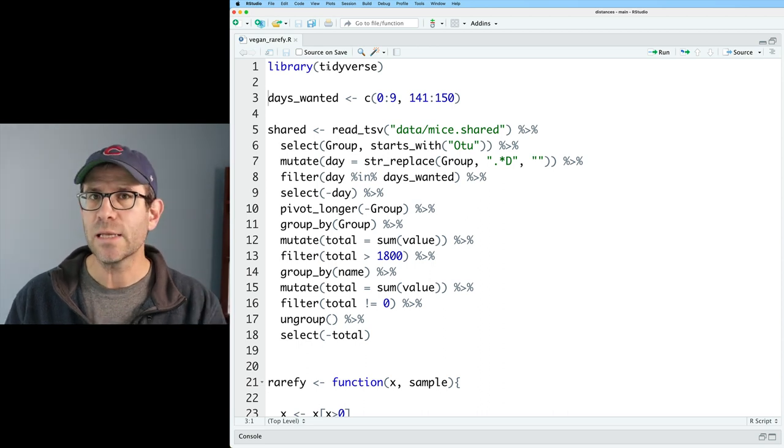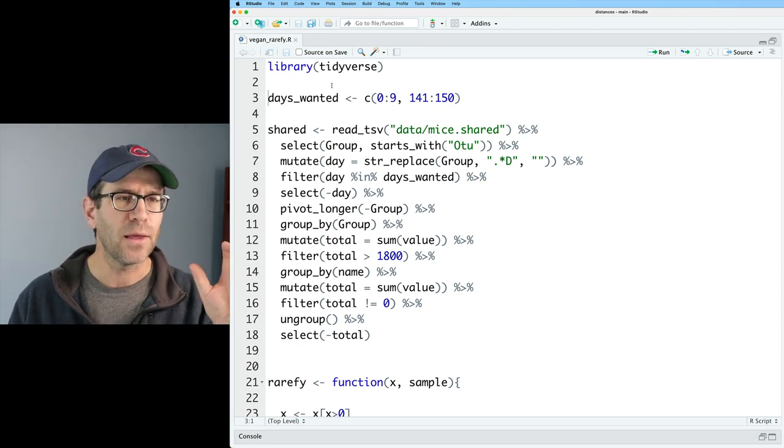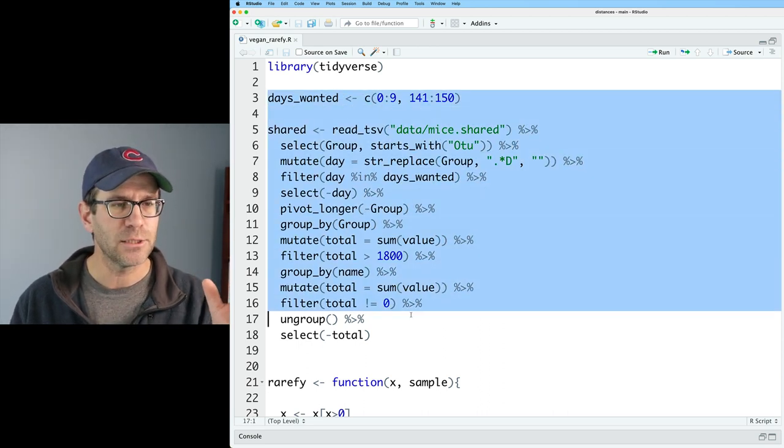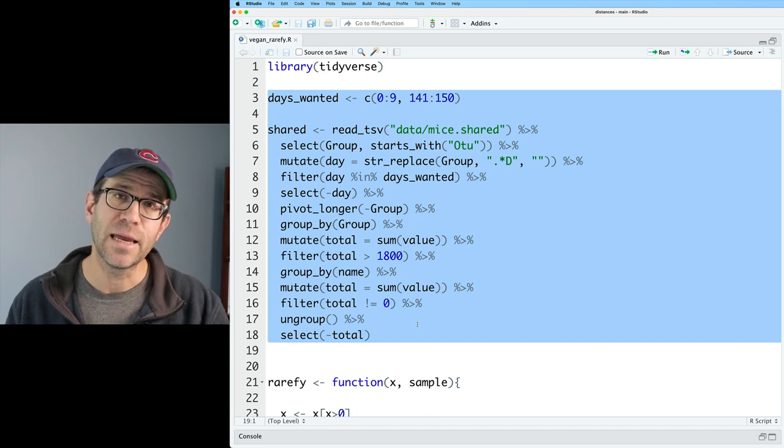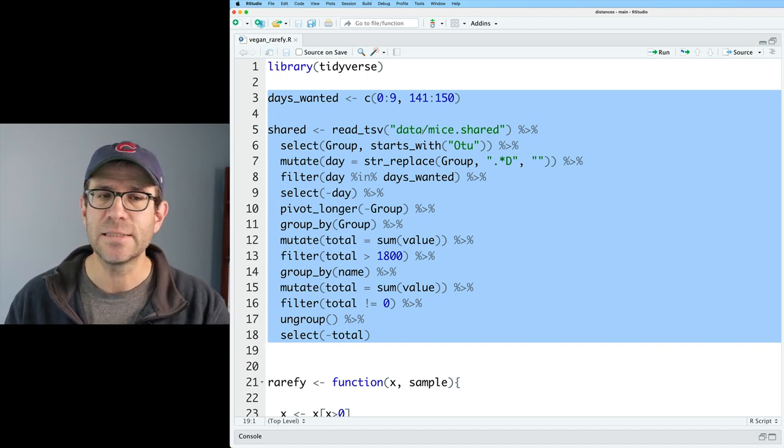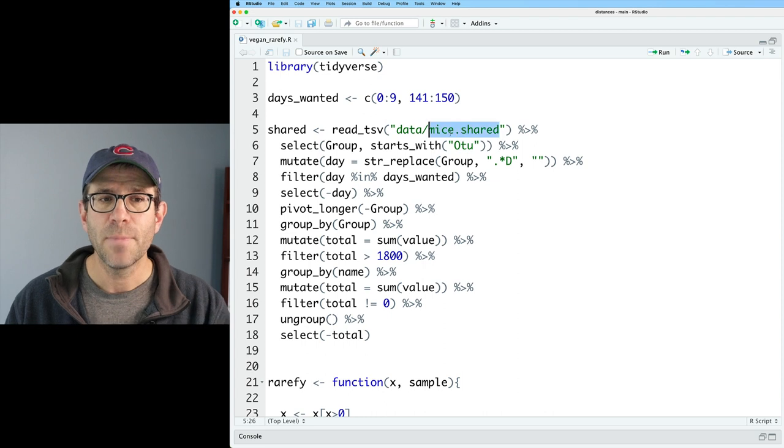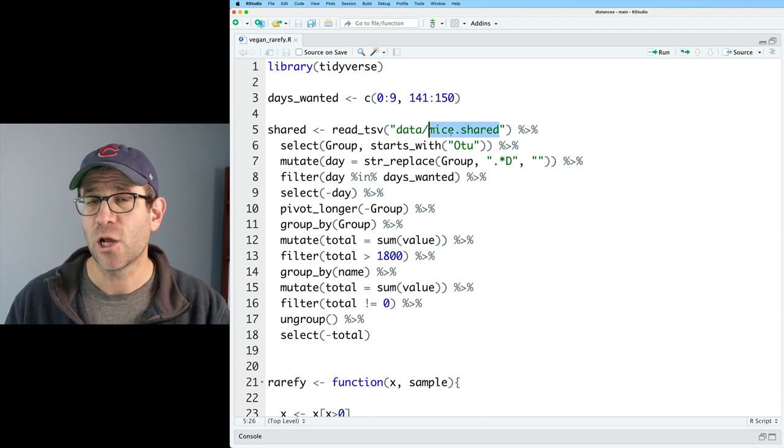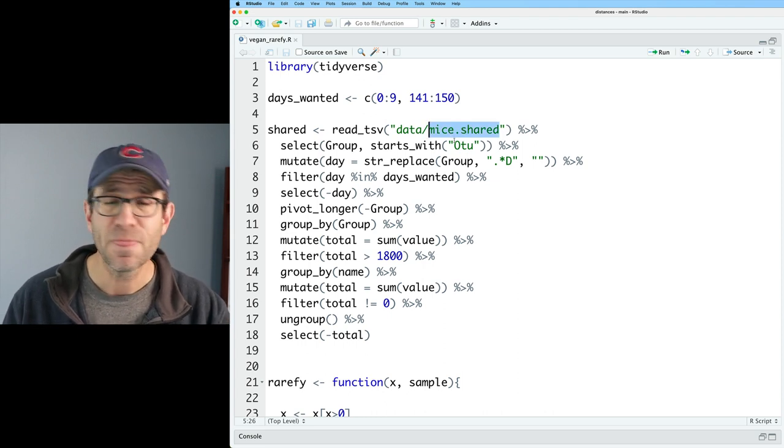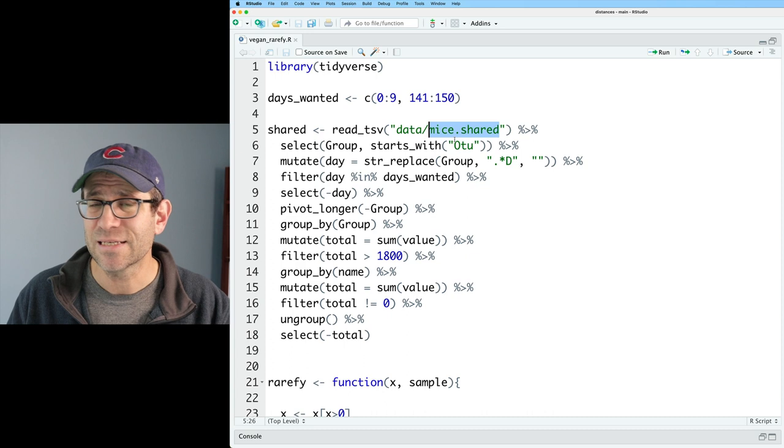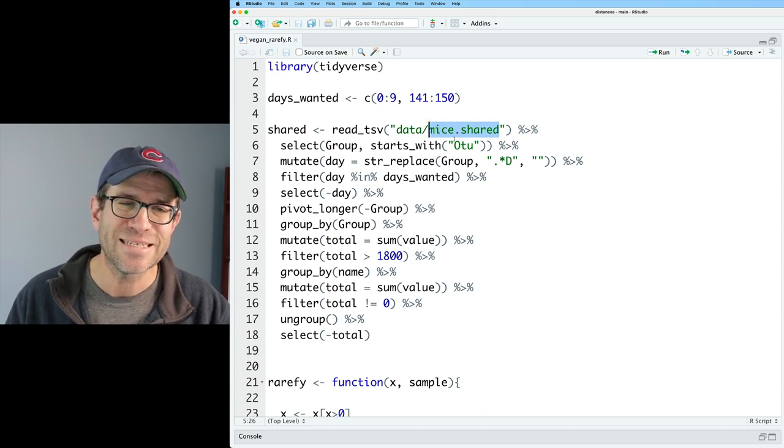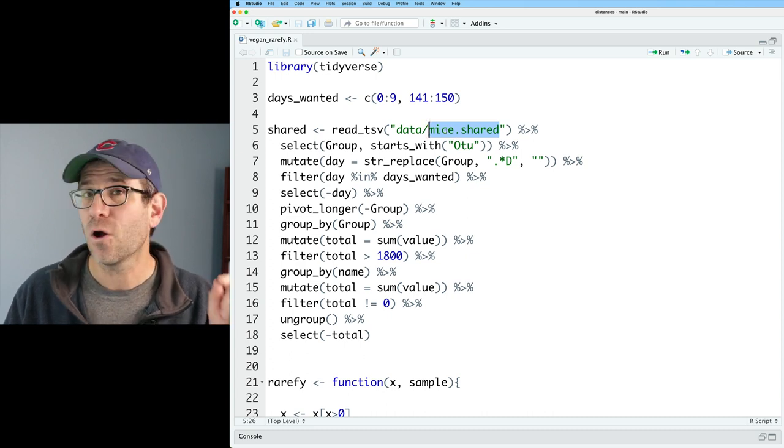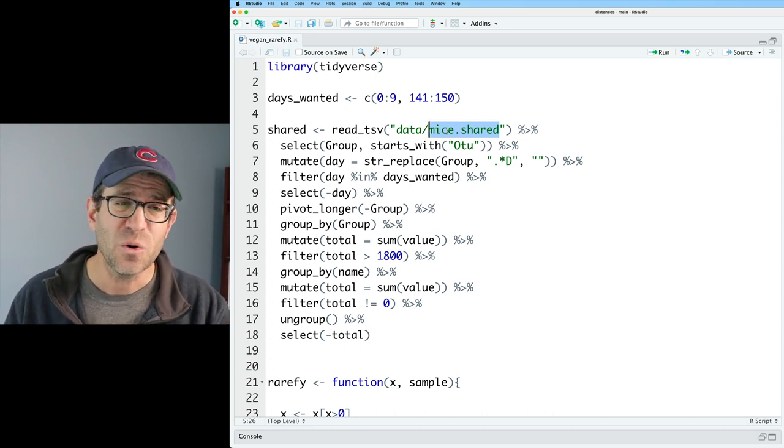So again, we read in the tidyverse tools and then there is this big chunk of code for reading in data from a file that's in data called mice.shared. Mice.shared was generated using a tool called mothur that's pretty specific to analyzing 16S ribosomal RNA gene sequences.